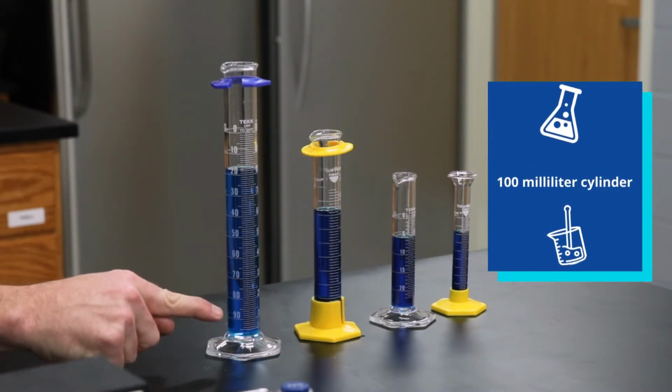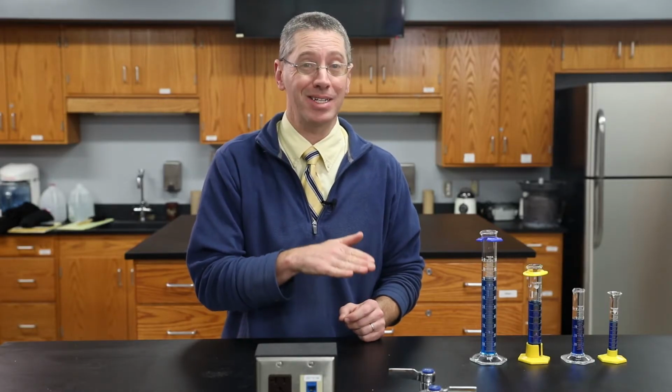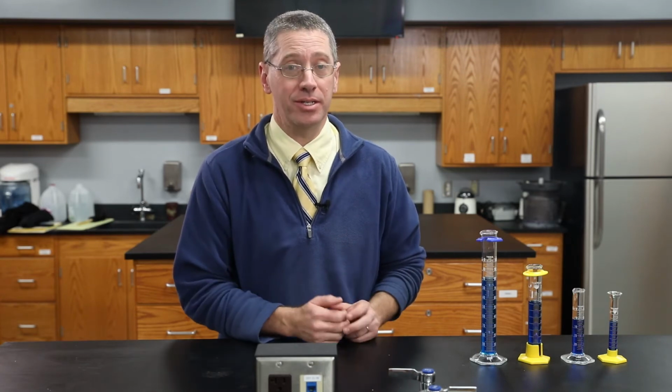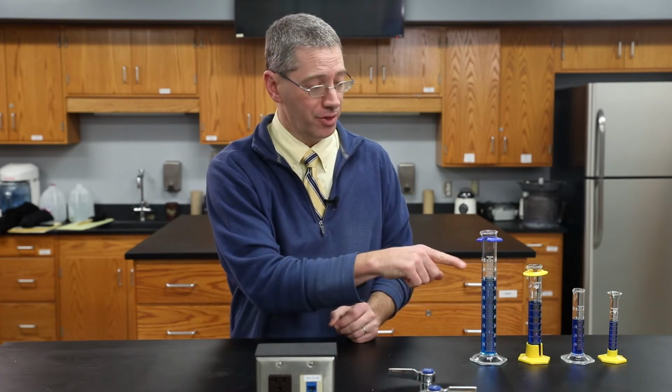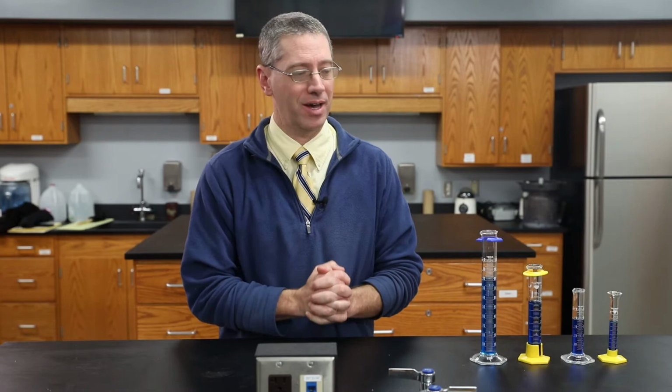So you read the total number of milliliters that you have, but you'll notice sometimes the meniscus doesn't line up exactly on one of the marks. So you estimate the next digit. For example, if it's filled up to the 80 and then it goes a little bit above that, you might say 80.5 milliliters. It's important to estimate that final digit.